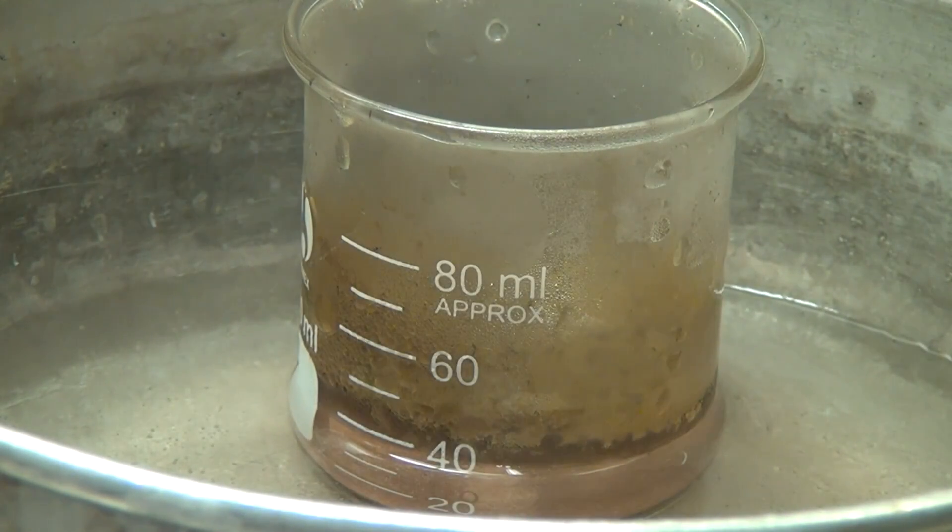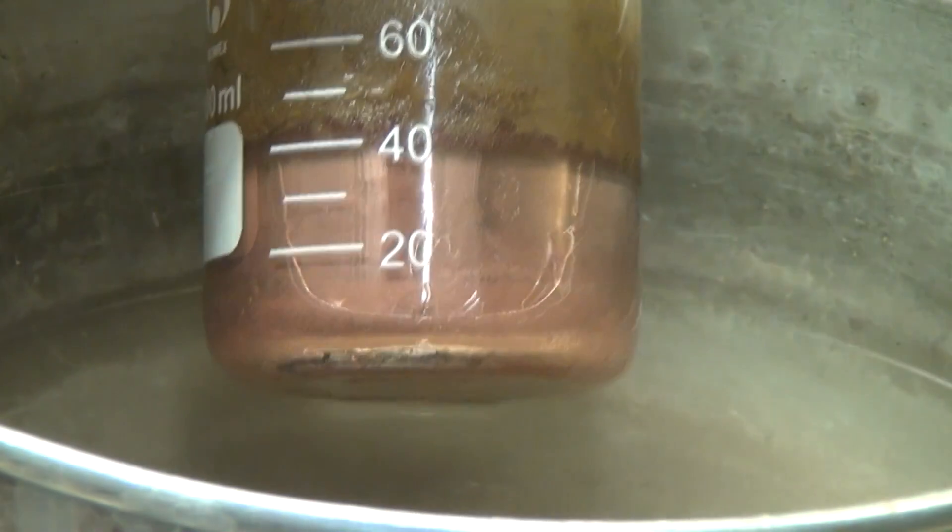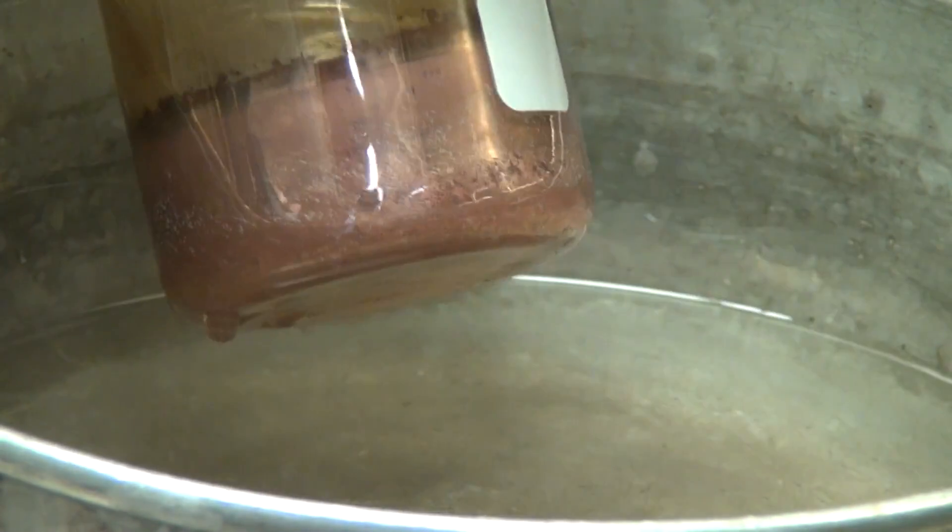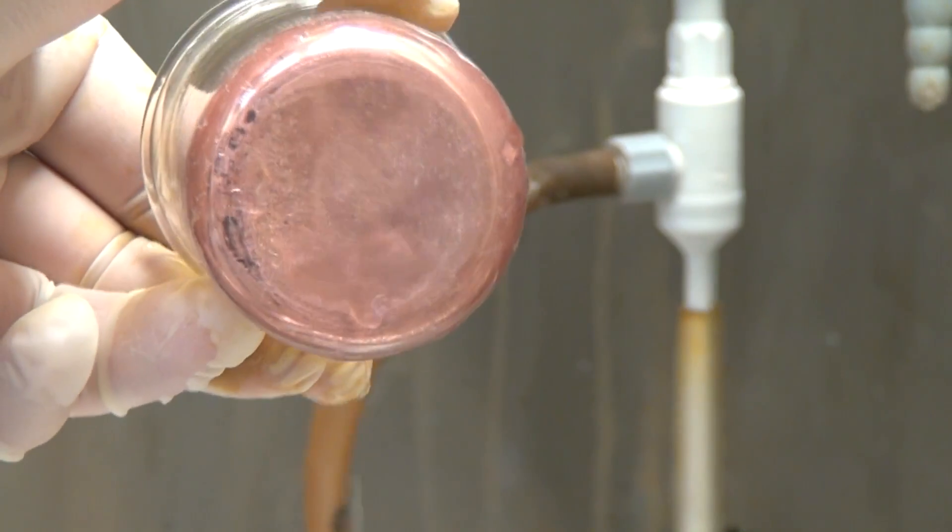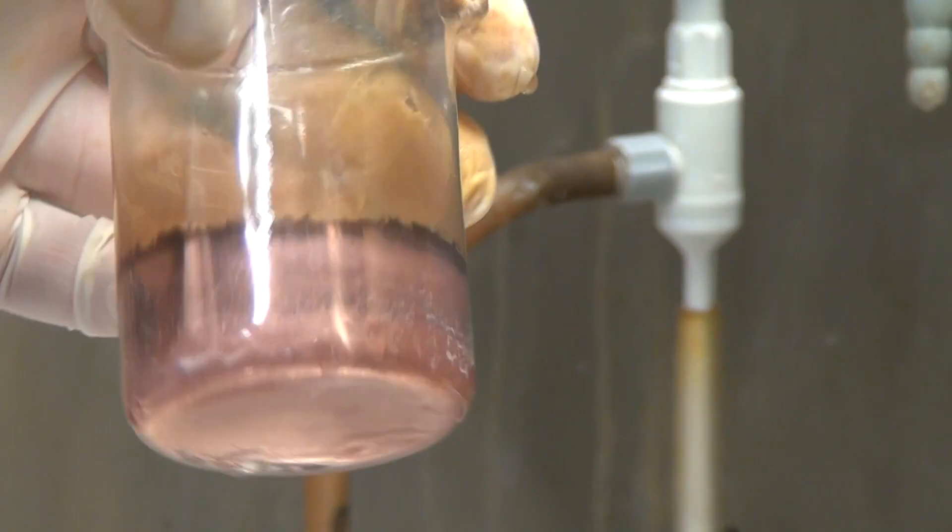After about 15 minutes of heating, a beautiful and shiny coat of metallic copper formed on the walls of the beaker. I poured the liquid off the beaker to better show you the resulting copper mirror. The layer reflects light pretty well.